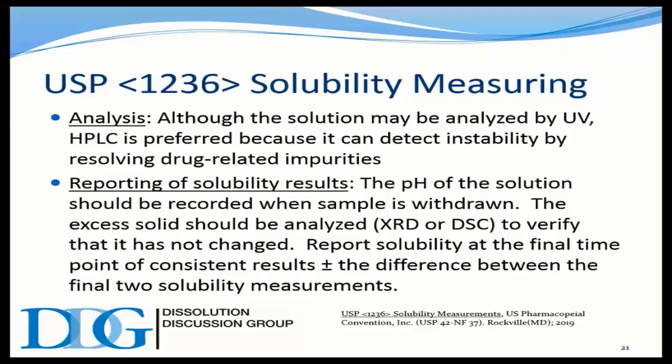But to me, this reads like a particulate test. You can do it in a regular dissolution vessel and add the maximum dosage strength of a drug and put it in a vessel to look at how fast that's going into solution. But generally, the excipients and the formulation are going to be done. You also have the intrinsic dissolution test, which, with a constant surface area, is going to give you a linear release of drug. And that's probably the most prevalent test.